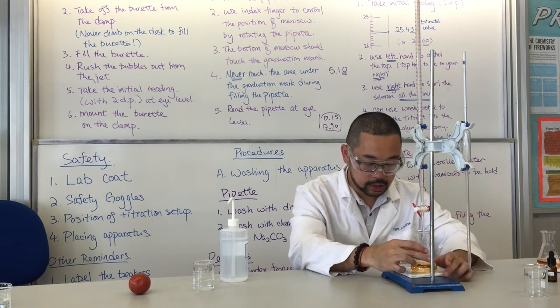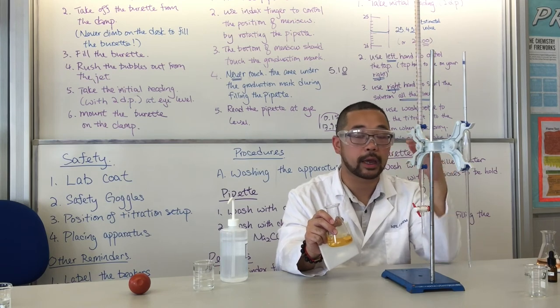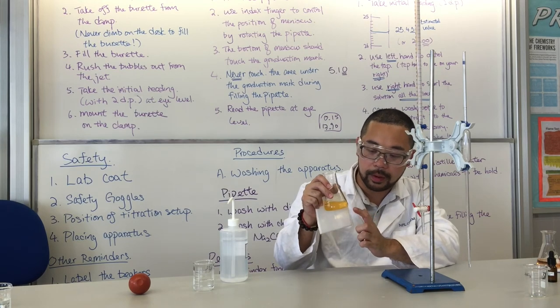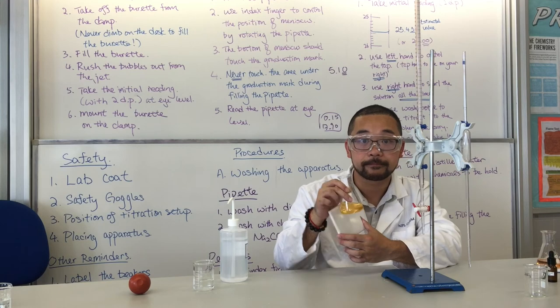So it seems that this color will be better. We'll take this one as the end point, and then we'll read the reading and write the reading down on the worksheet. So the color you're expecting will be orange. It will be like this.